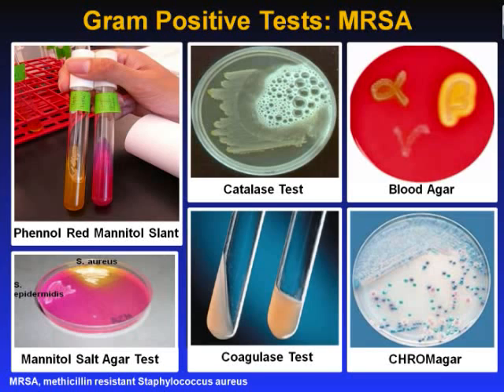Alpha hemolysis occurs when an organism is capable of partially digesting the red blood cells and is represented by the partial zone of clearing with the gray-green colorization. Beta hemolysis occurs when an organism is capable of completely digesting red blood cells and is represented by the complete zone of clearing with yellow tint. Gamma hemolysis describes a culture of bacteria with minimal to no hemolysis.